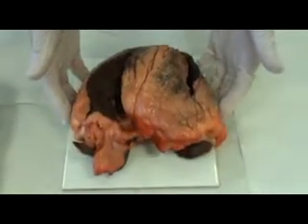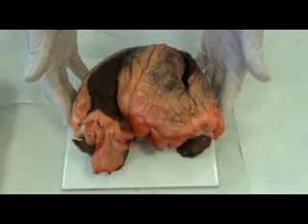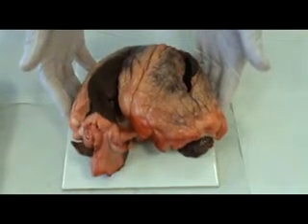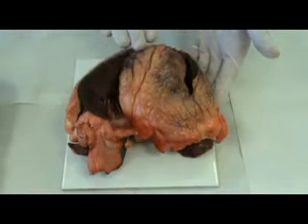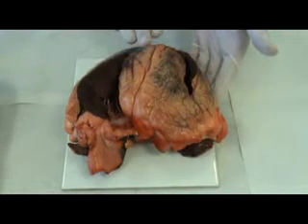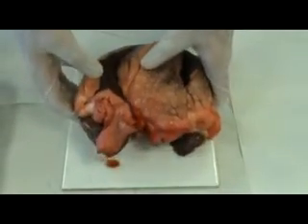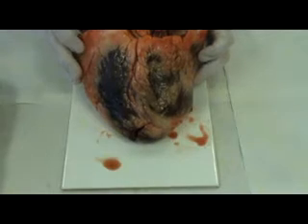The heart, like any organ, has a number of views, and these are important to note before the dissection begins. This is the anterior view, sometimes called the frontal view, and if we just turn the heart around, that would be the posterior view.